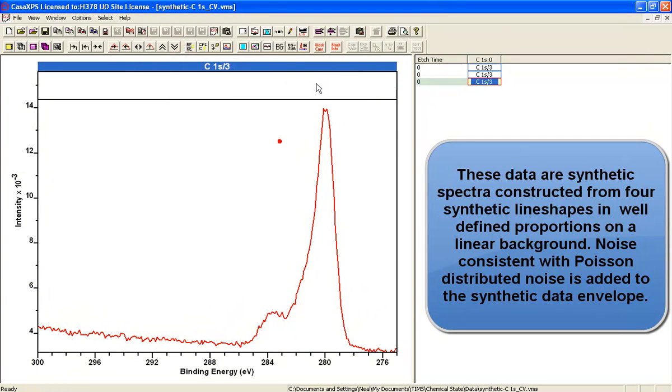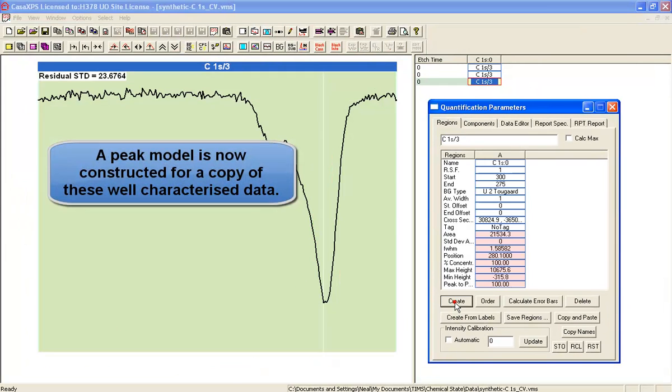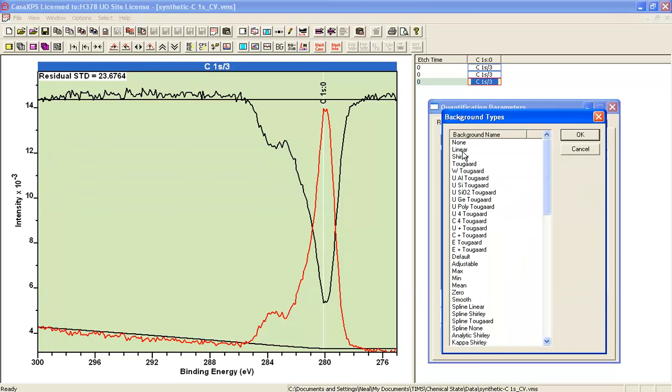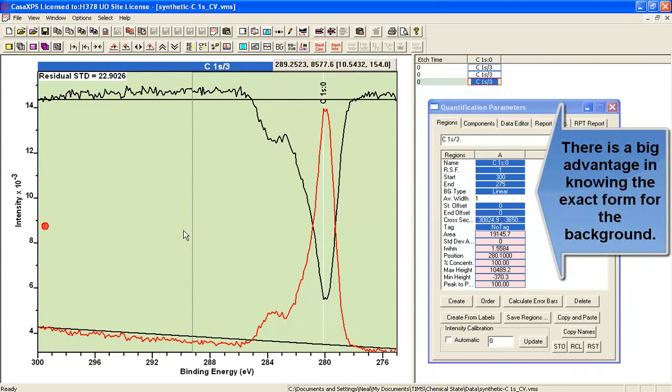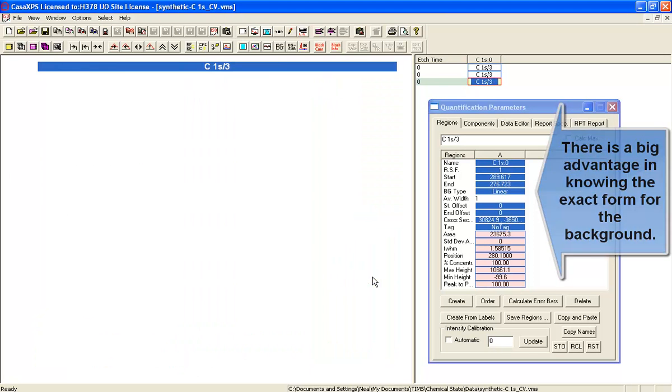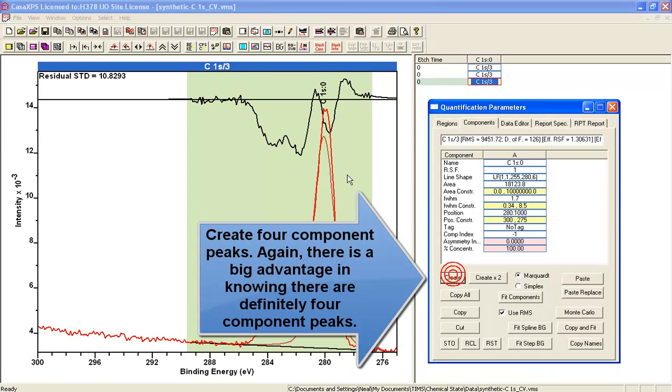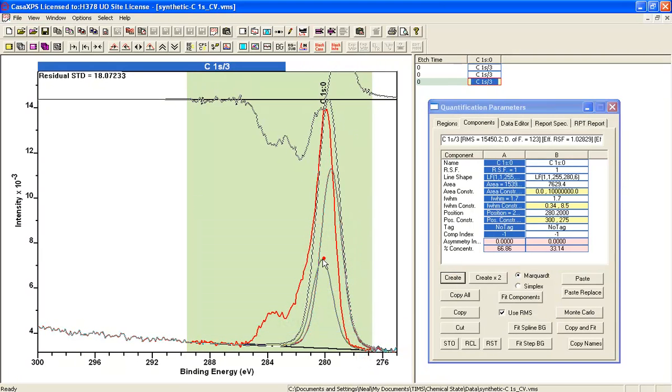So we have now got a spectrum that looks like a carbon 1s and we know exactly what is within these data. So we ought to be able to reproduce this quite nicely based on generating a peak model with four components and a linear background. So this is what we'll do. We'll introduce a linear background, create a set of four components and fit these against the data.